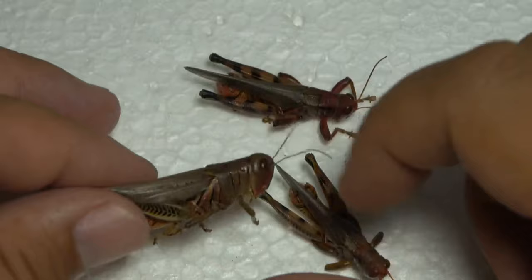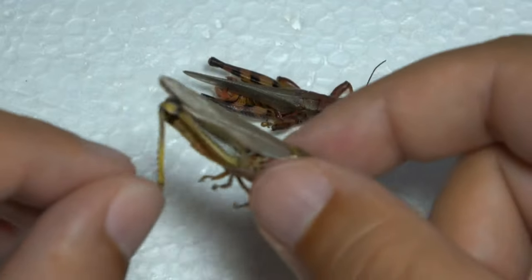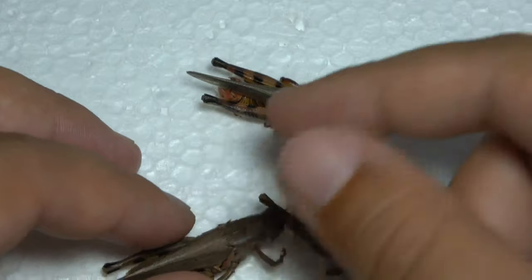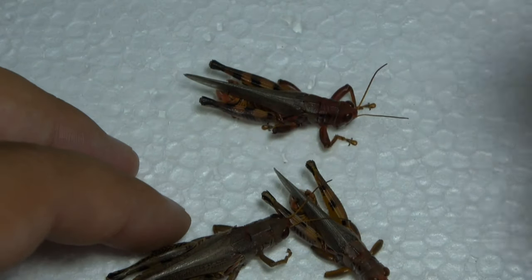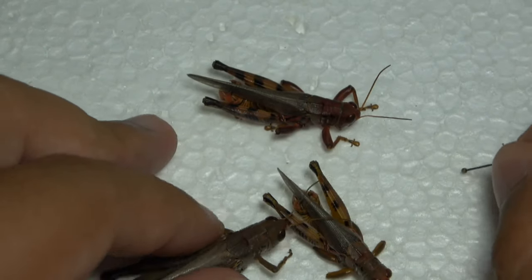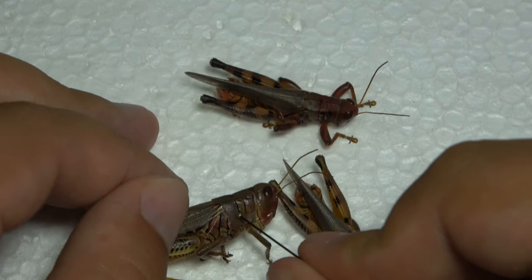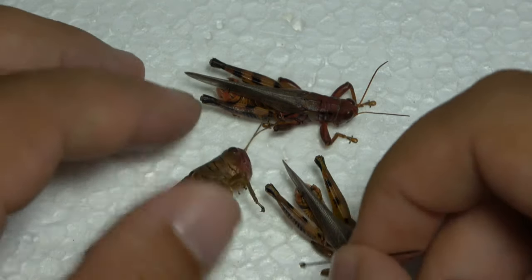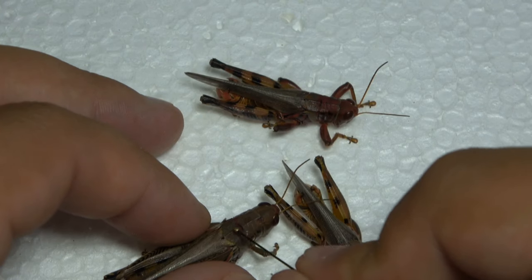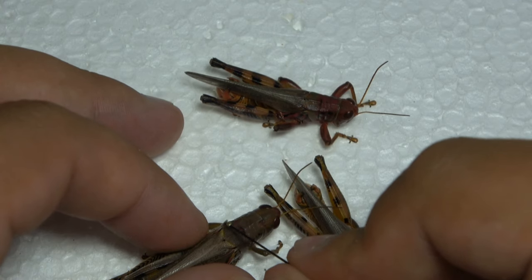So here I just got a nice grasshopper. Pinning grasshoppers, katydids, and crickets is straightforward and easy, like pretty much all other insects. You have the head, the thorax, and then the abdomen. This plate right here between the head and the start of the wings is called the pronotum, and that's where you want to pin orthopterans.